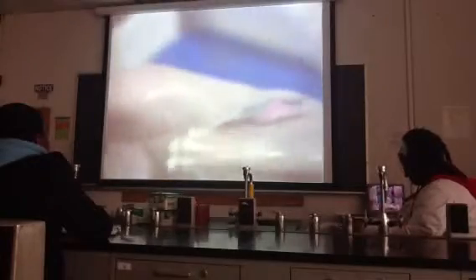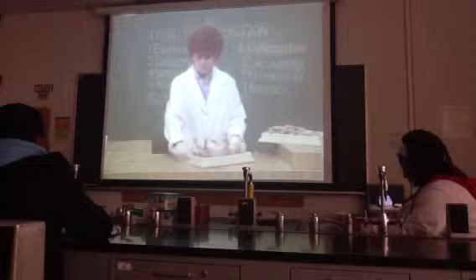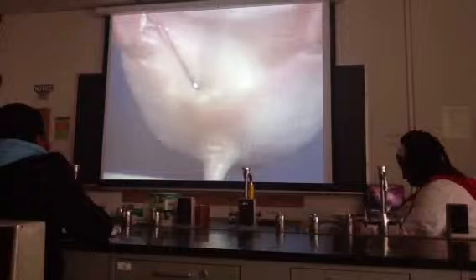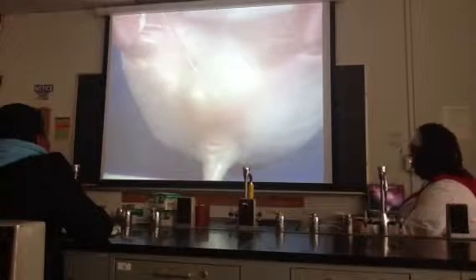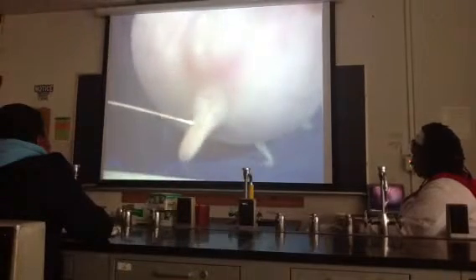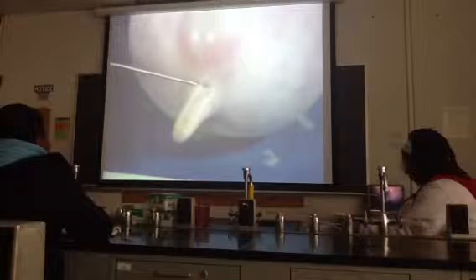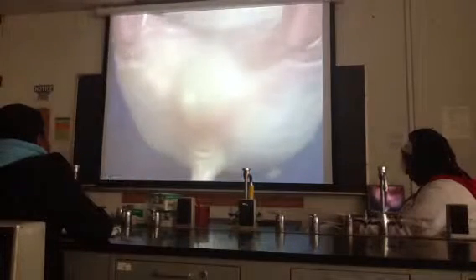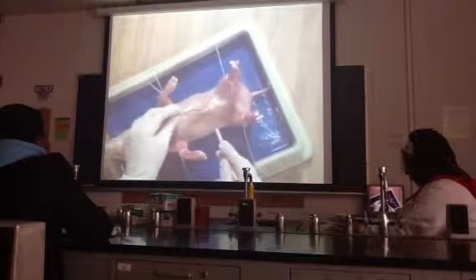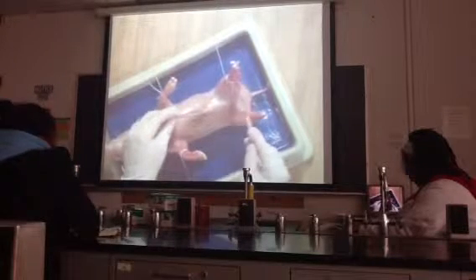Looking at the male fetal pig, we see the presence of a swelling at the posterior end known as a scrotal sac. In the adult male pig, this will house the testes. Also note that in the male pig, immediately below the tail is an opening called the anus. The urogenital opening of the male is just behind the umbilical cord. And if we follow this caudally towards the anus, this is a penis.